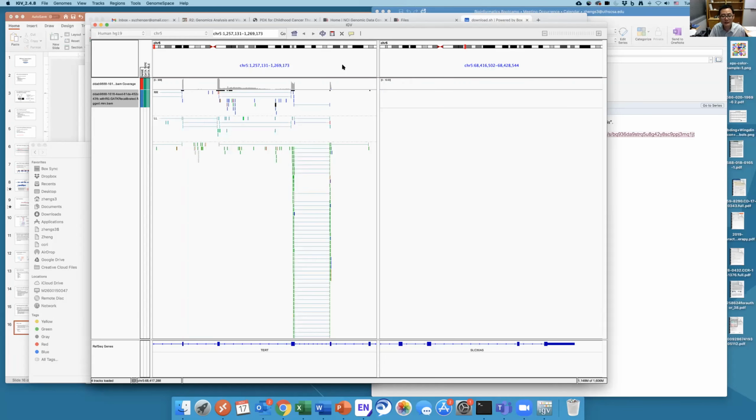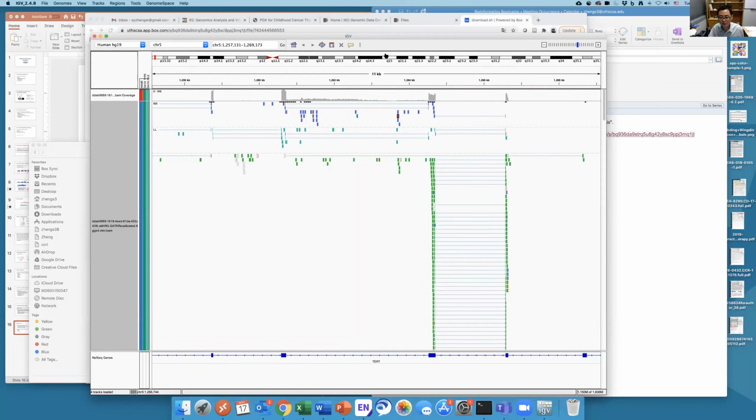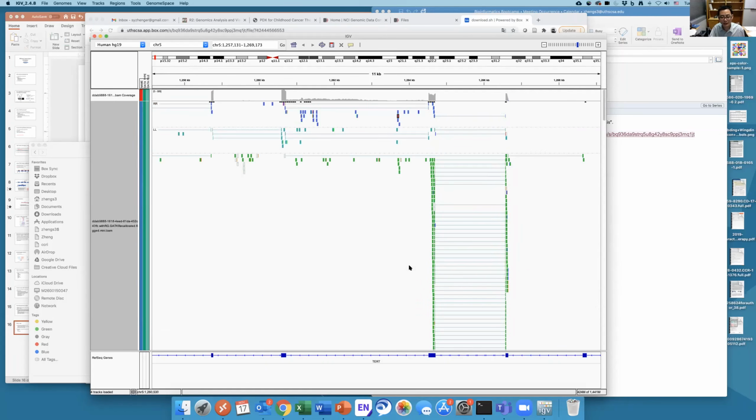Now you can do a lot of things. I don't know if Henry, if the class actually has some tutorials on IGV, and I think this is a really, really useful tool to visualize not only the sequencing data, but also the copy number data and gene expression data. I really enjoy using IGV for my copy number analysis. Actually, I can do a great deal within IGV without writing any code for copy number analysis. But anyway, this is how IGV looks, and you can see here all the reads.